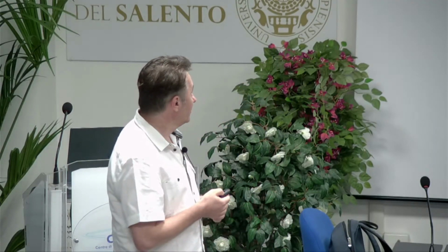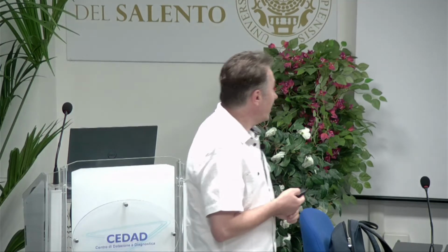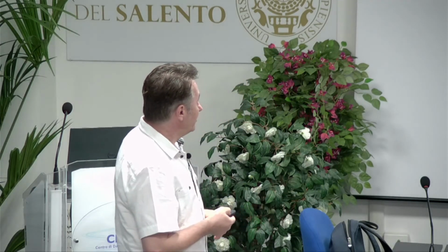Welcome to the second part of the seminar, where I will try to introduce very briefly the high-resolution TEM imaging, scanning TEM, and some analytical techniques. Starting with the high-resolution TEM, let me remind you that we are now in the situation in which, with the help of an objective aperture, we select, together with the transmitted beam, several diffracted beams. So we use all of them to create an image.